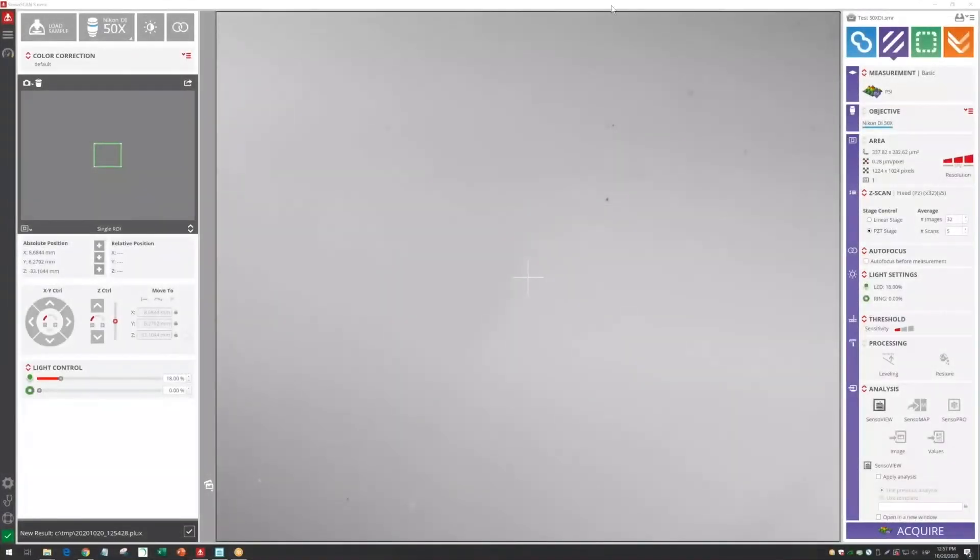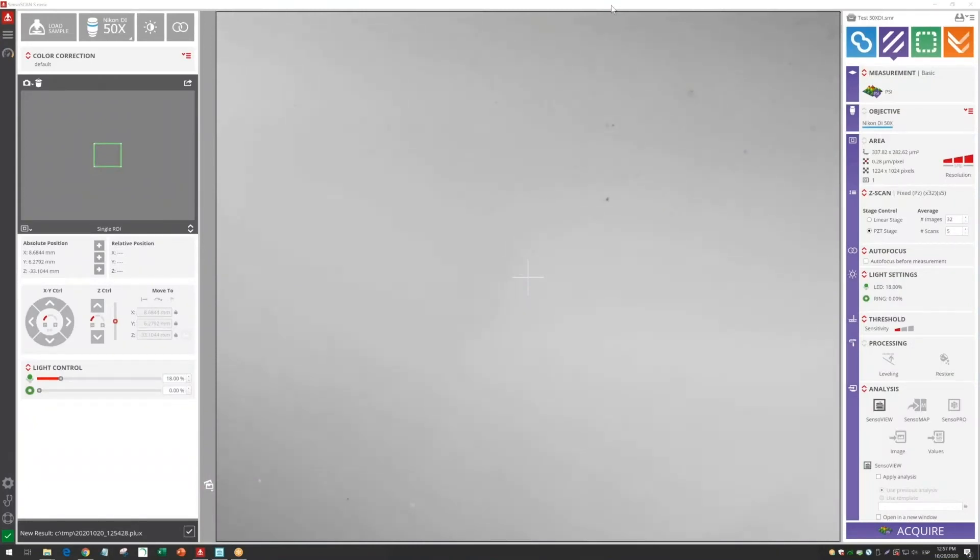Hello everyone, this is Alberto from CENSOFIRE, and today I'm going to explain to you how to measure ultra-polished surfaces.